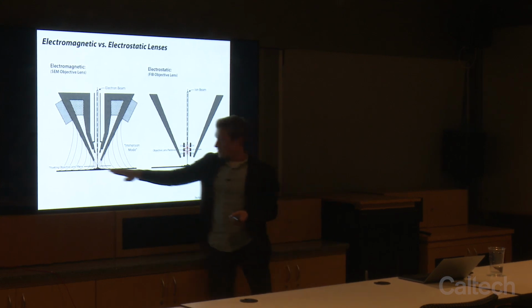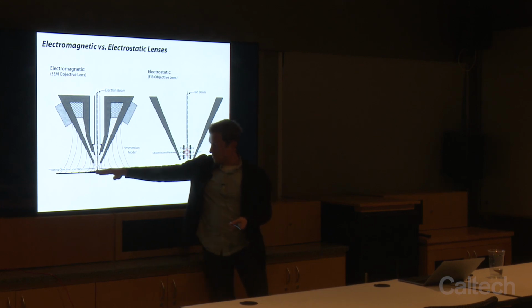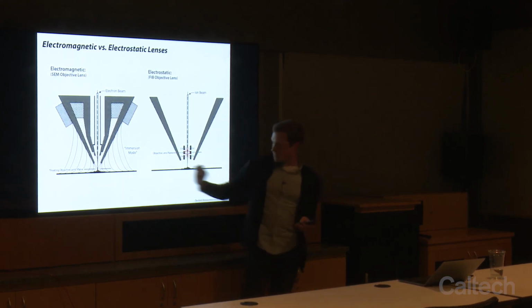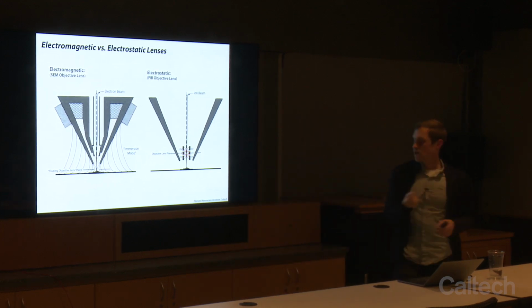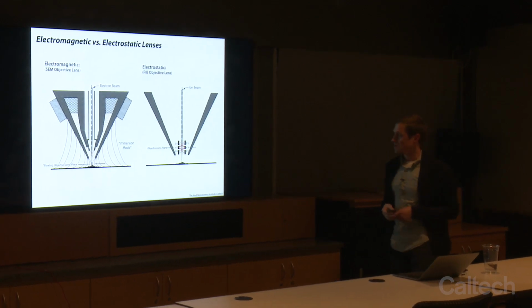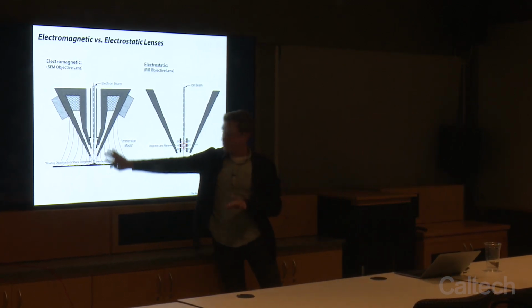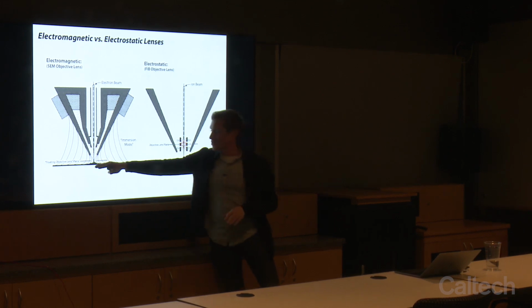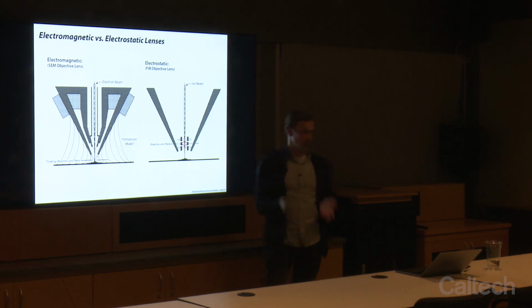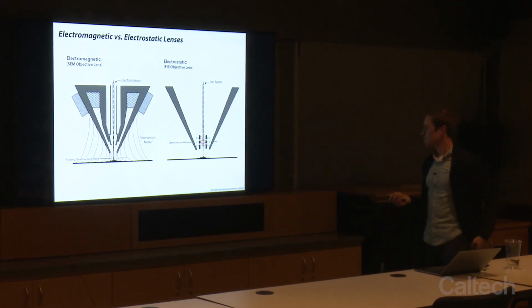And so we have what's called the floating objective lens plane. It's going to be halfway between the column and the sample, and we'll see how that working distance, and we'll describe what that means, we minimize the working distance, and that allows us to get a smaller probe and get higher resolution. Note that when you do this, if your sample is magnetic, you've magnetized the pole piece, and your sample might get attracted up to it. So you don't want to do this with magnetic samples.